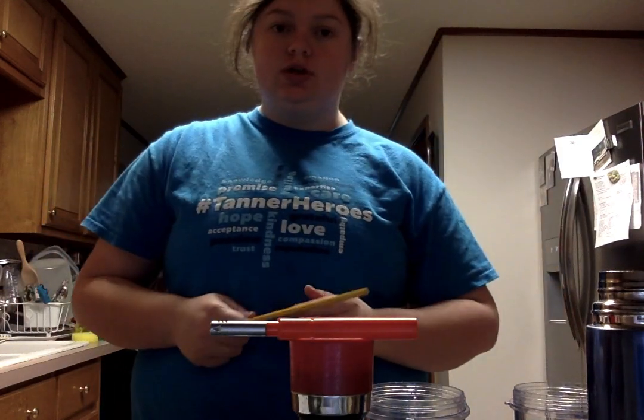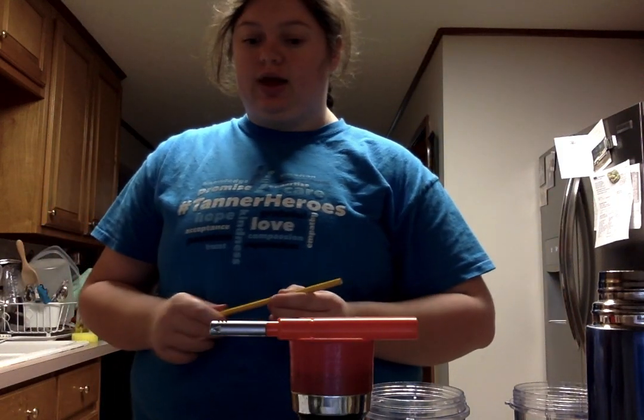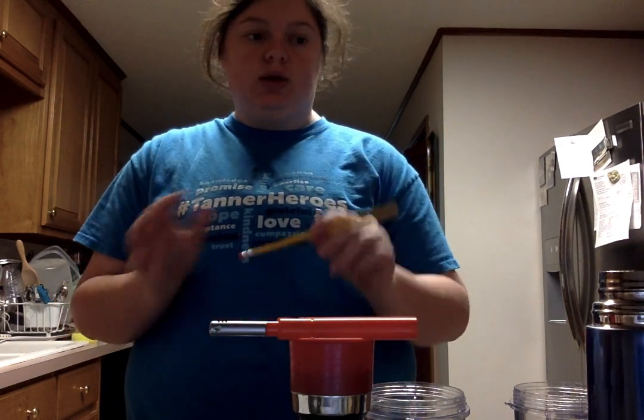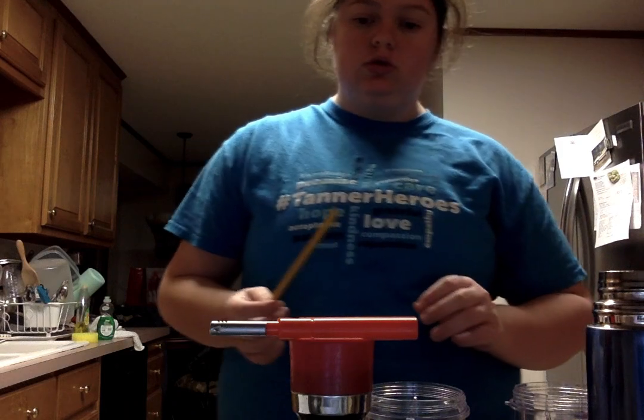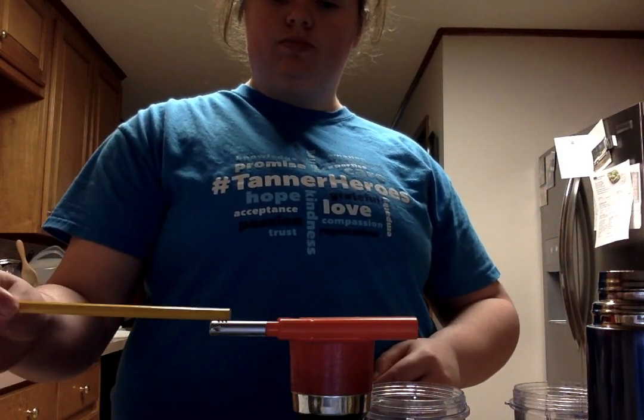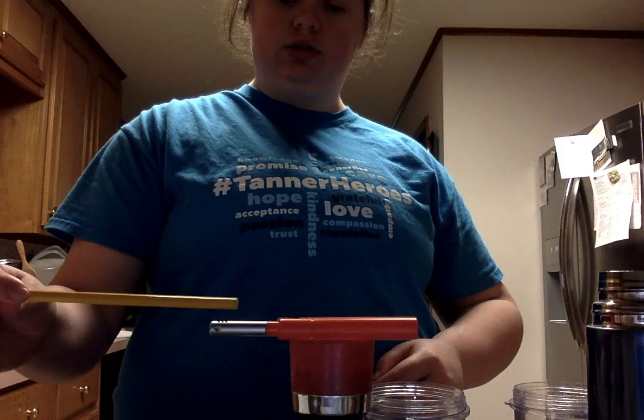I'm going to be redoing the Petri dish because I messed up on the last one, so I'm making a new video so I can submit it correctly. I'm going to burn my inoculating loop for 10 seconds to sterilize it.